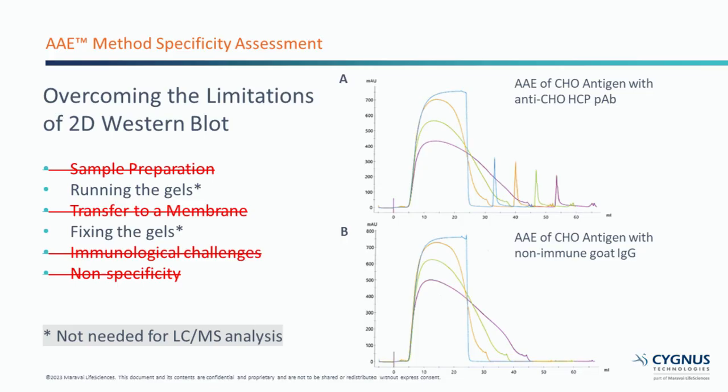But thankfully, mass spectrometry does not have these limitations. Also, one of the criticisms of the AAE was: do you know that your method is specific?